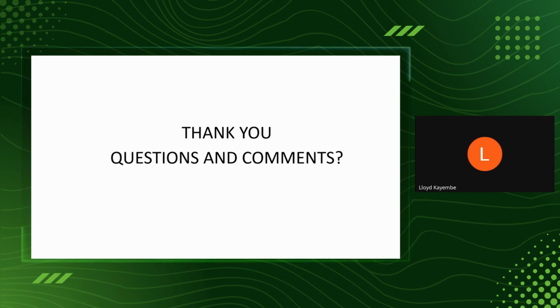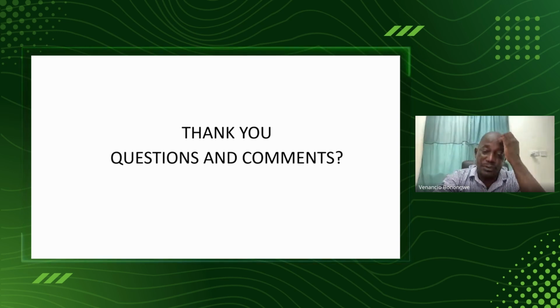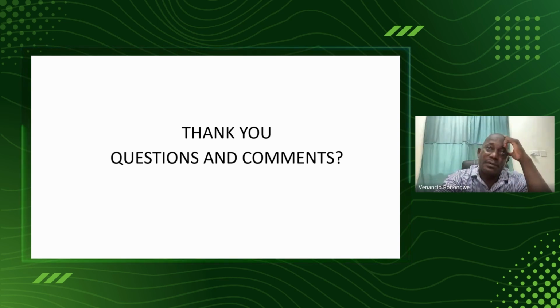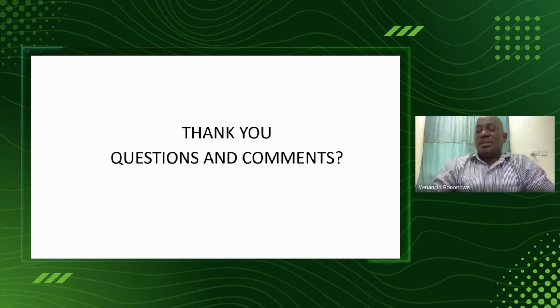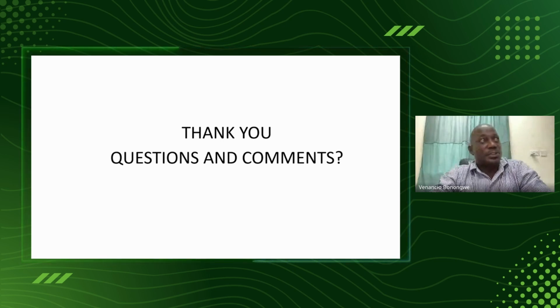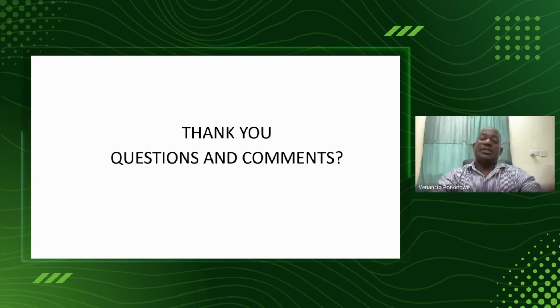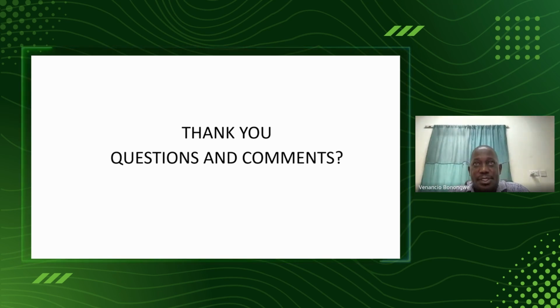Engineer Bonongwe, you raised your hand. I'll give you a chance to address the question as well. Thank you very much. I want to respond to the question from Foster Sentala about vacuum sterilization. Vacuum sterilization is not quite as he has put it, but what happens is that during the sterilization cycle, there is a vacuuming process.